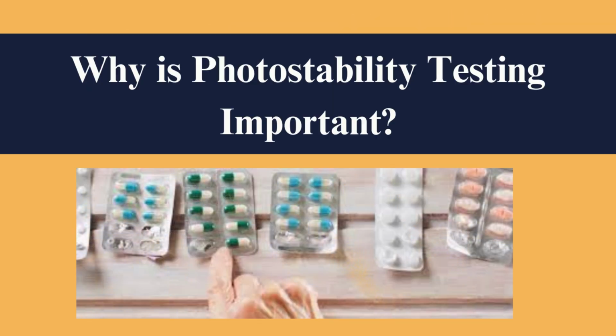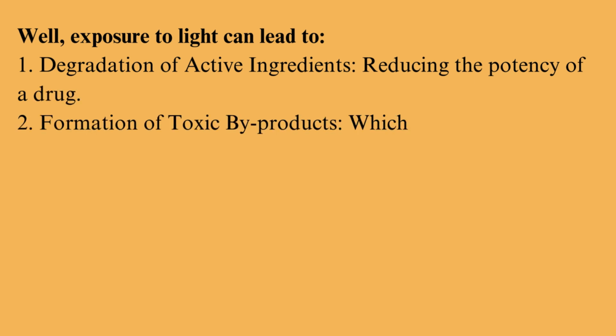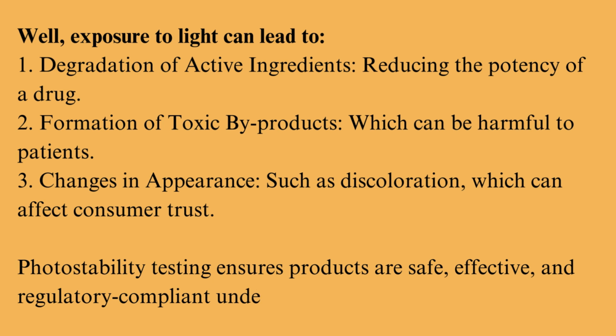Why is photostability testing important? Well, exposure to light can lead to degradation of active ingredients, reducing the potency of a drug, formation of toxic byproducts, which can be harmful to patients, and changes in appearance, such as discoloration, which can affect consumer trust. Photostability testing ensures products are safe, effective, and regulatory compliant under real-world conditions.